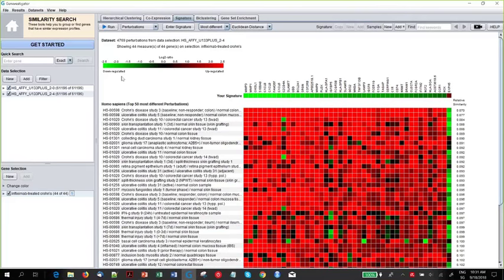And amongst these results of opposite profiles, we find several data sets on the top, being comparisons of IBD, disease versus healthy. This is what we would expect. What you will also find are studies on skin transplantation, or going down, another one on skin transplantation.